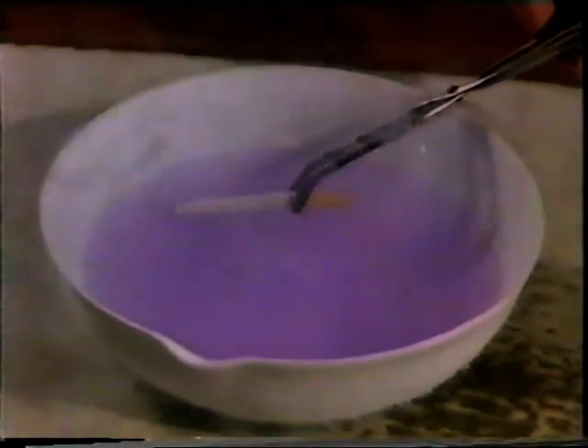You've probably seen how a cigarette burns in air, but let's see how it burns after it's soaked up liquid oxygen.